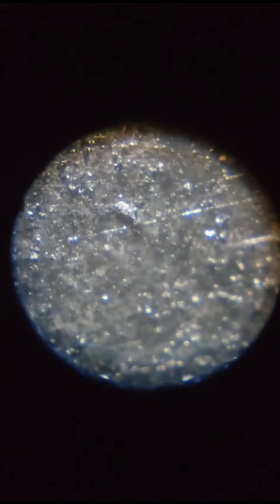Hey, stop moving it. We have changed the microscope to 100 times. No, this paper. You're shining it. This is the right one. It looks like that in 100 times.